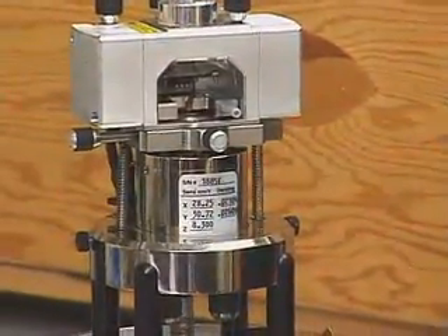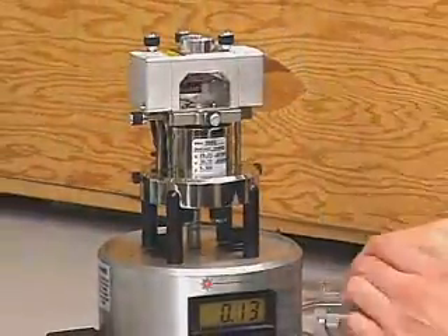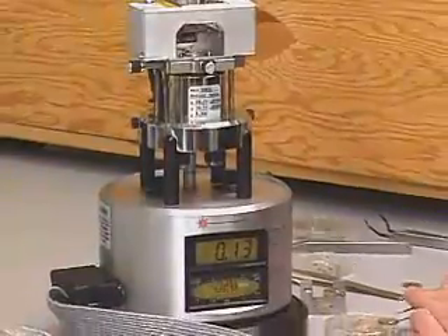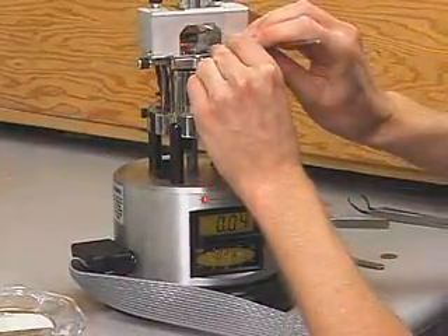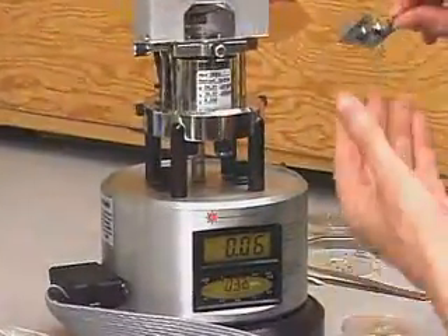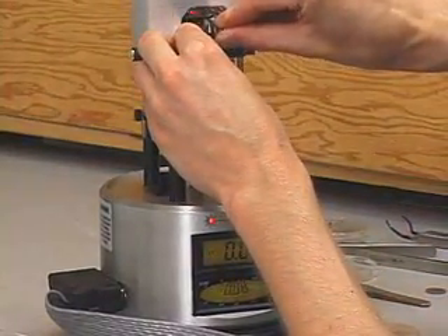Once the laser is aligned, we're ready to mount our sample in the AFM. First, I'm going to take the tip out so it's out of the way, and then I can mount the sample onto this electronically controlled stage. I can move the sample with nanometer accuracy.